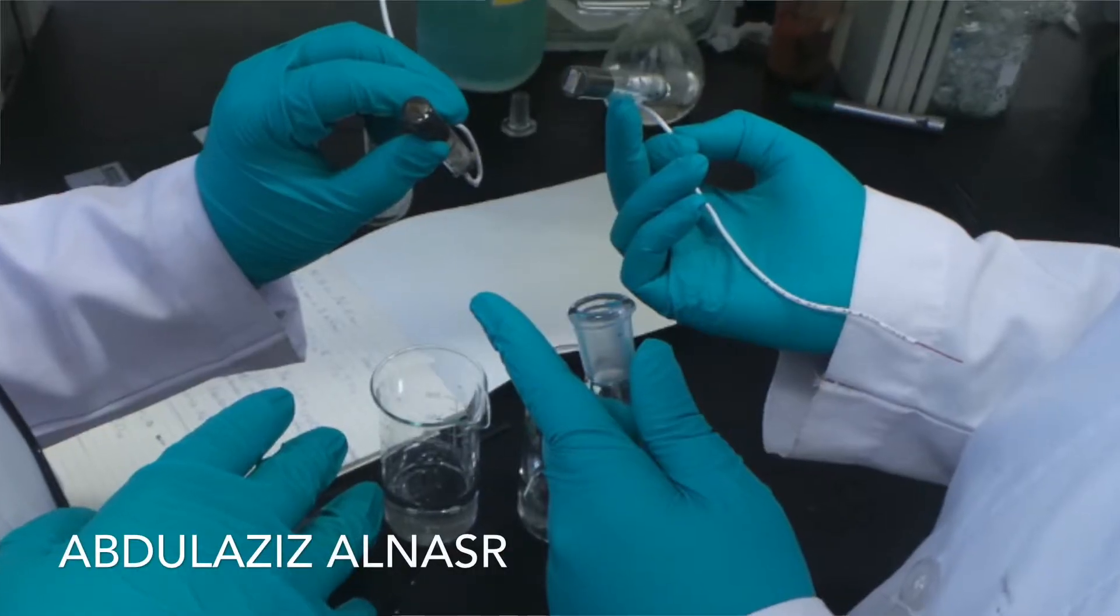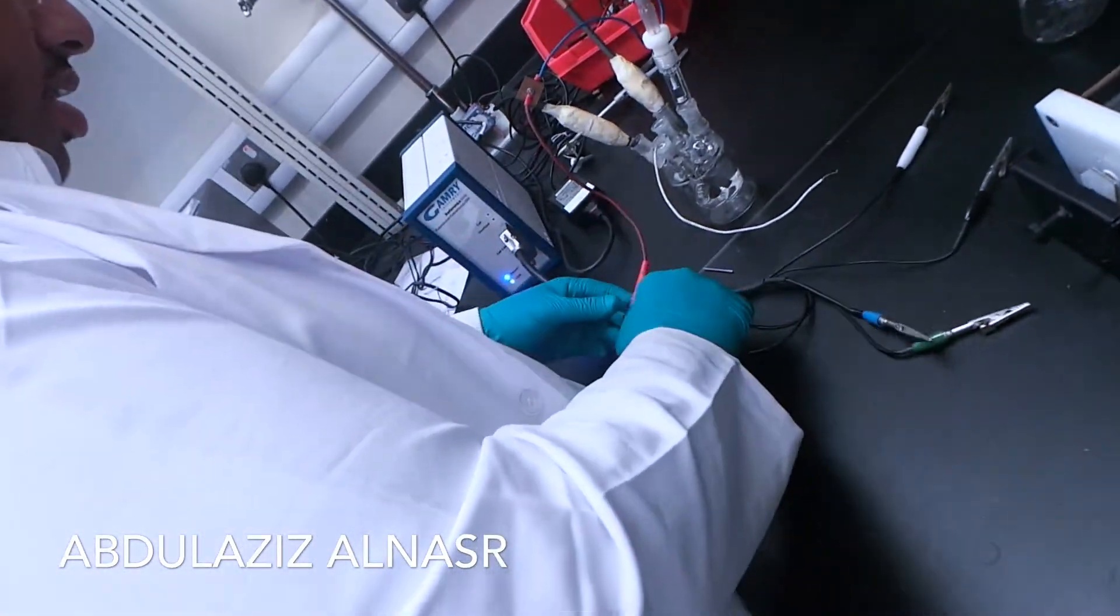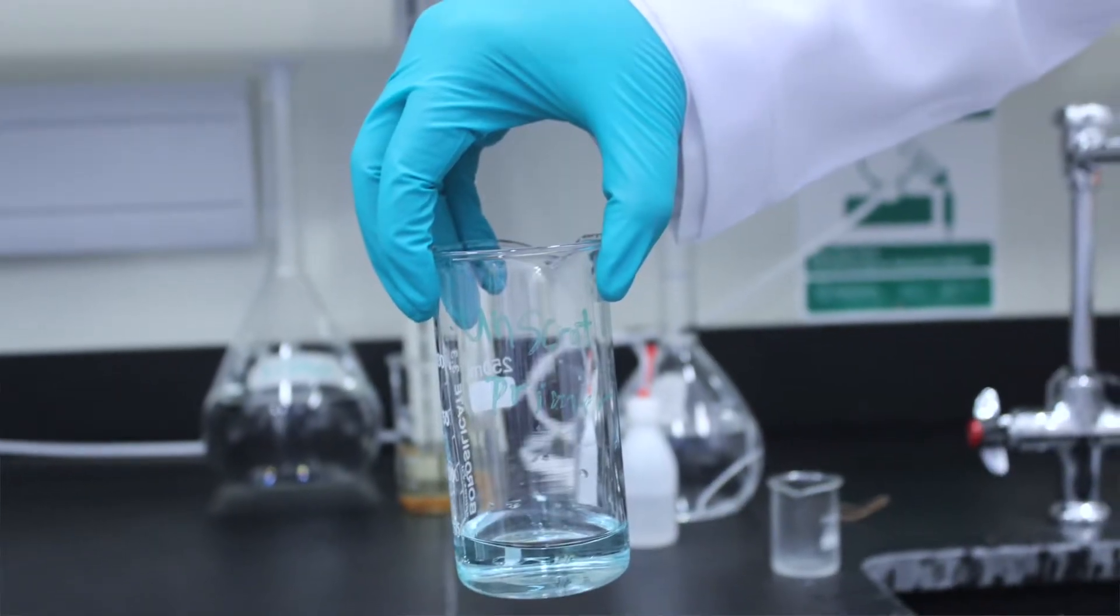What we did is we took both electrodes. We took the first one and tested it with nothing on it, then we tested it with copper nanoparticles on it. We just put it in copper sulfate for 30 minutes. After that, we took both of the electrodes and put them in benzotriazole for two hours.